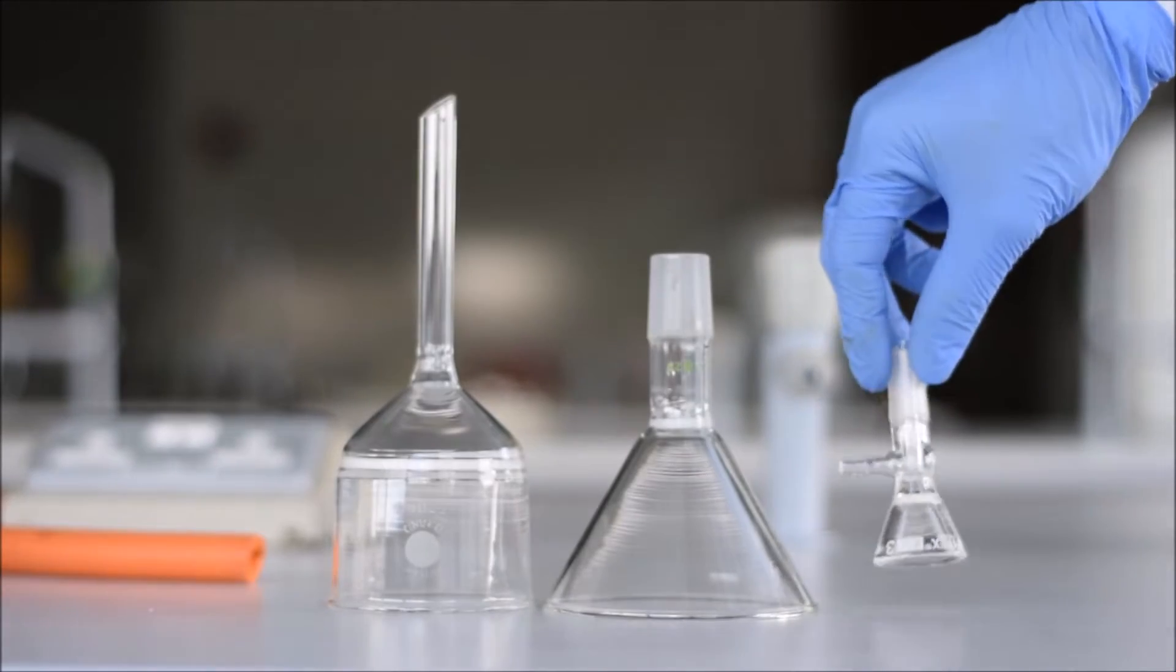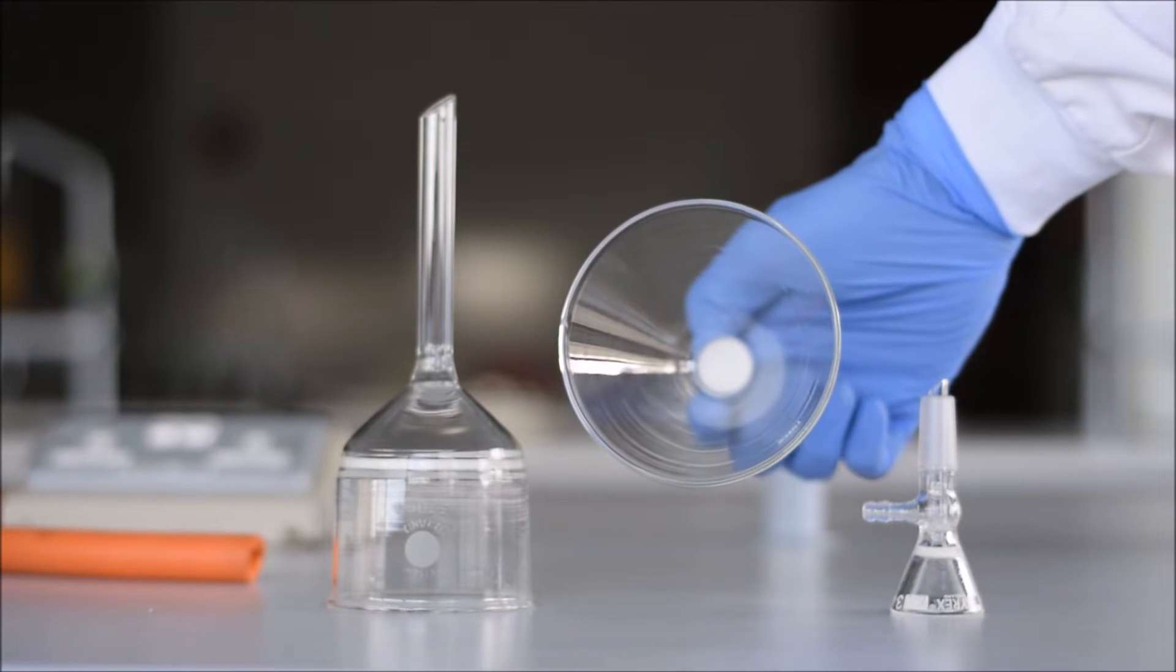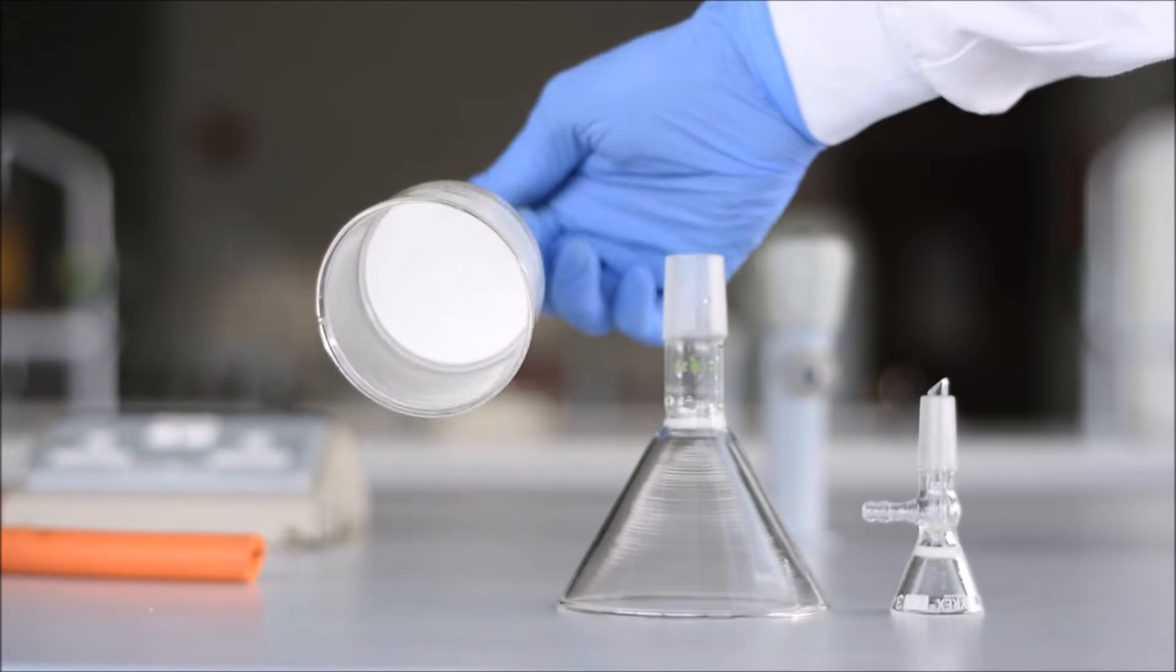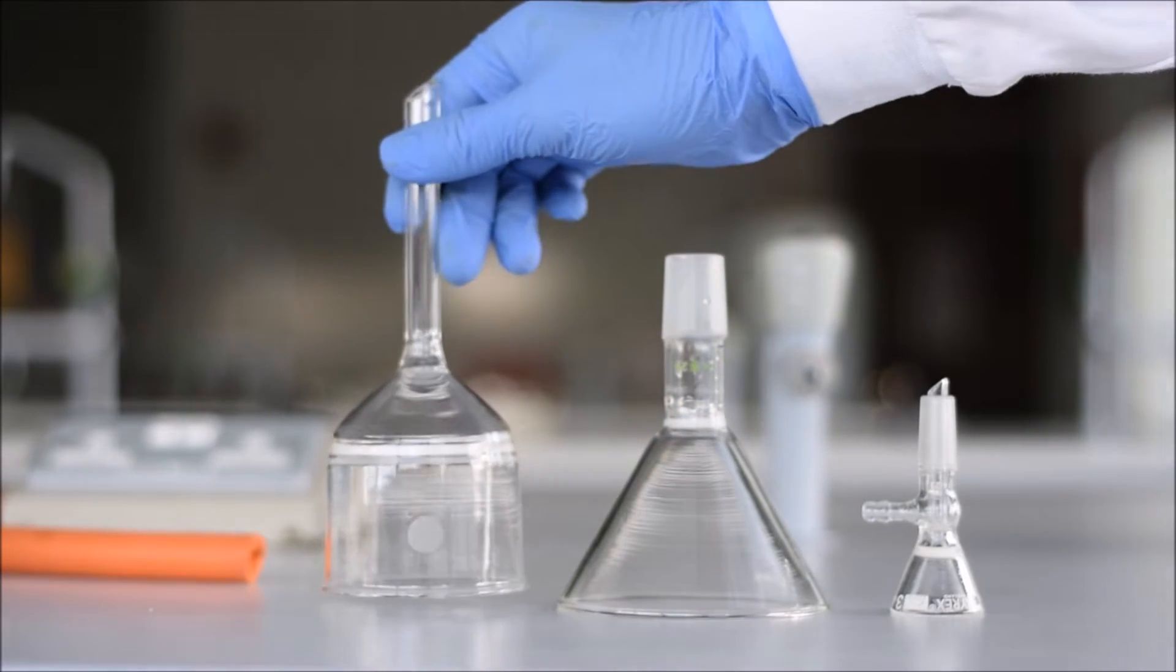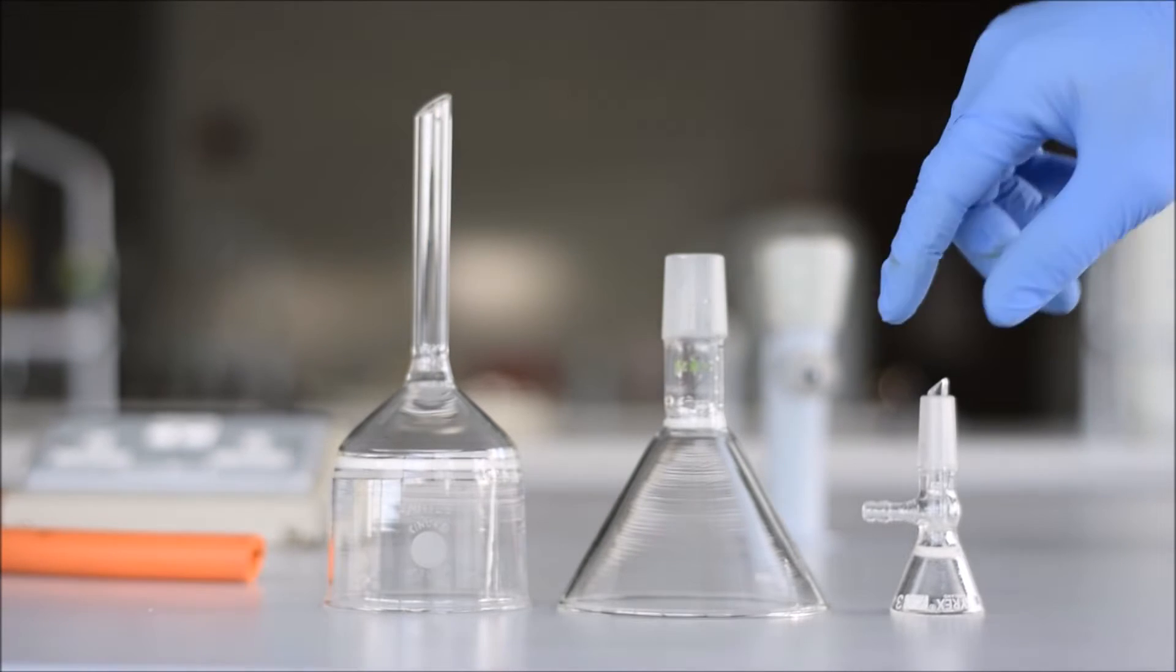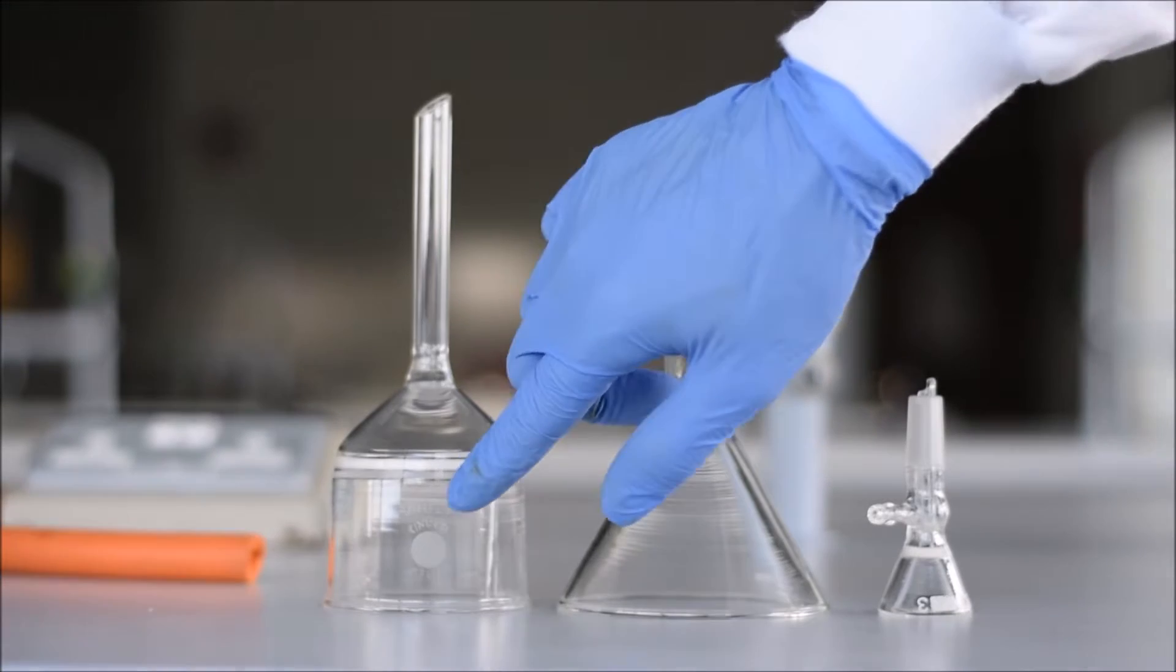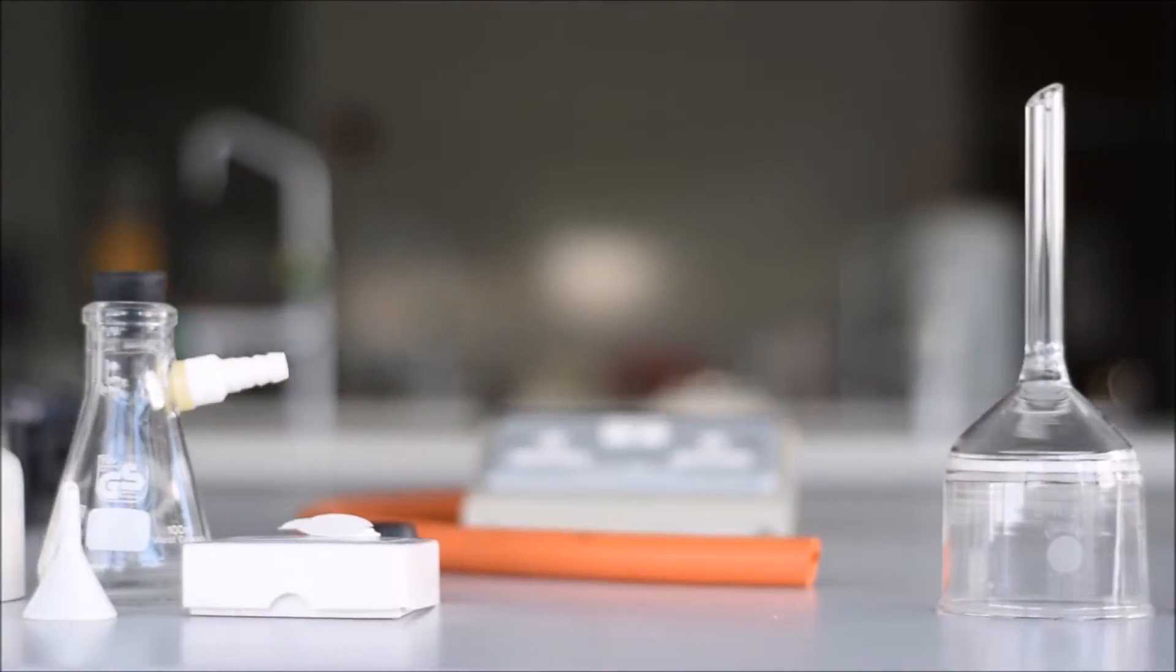Another choice available is a fritted funnel. A fritted funnel has a layer of sintered glass across the entrance to the funnel which filters out the material, and that fritted glass is made of tiny particles of glass melted so they stick together but don't form a solid layer. They can come with various different porosities or fineness of filter and they're really quite useful. We'll come back to them again too.